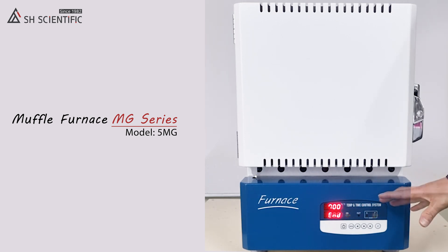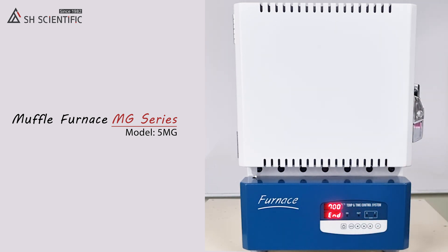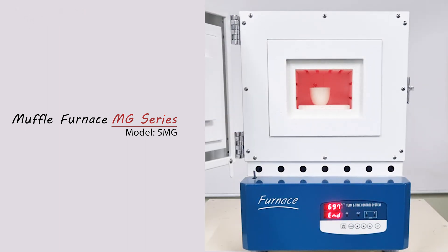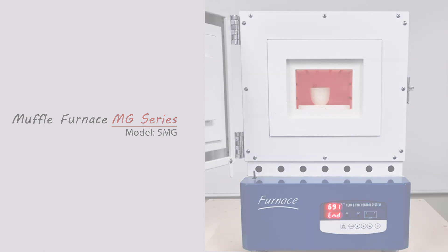Time is up, so run, out one, and out two are all off, and the beep alert has started. I'll open the door to show how the inside of the chamber looks. How beautiful it is. You can press the power button one last time to stop the beep and shut off the furnace.